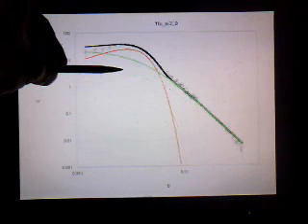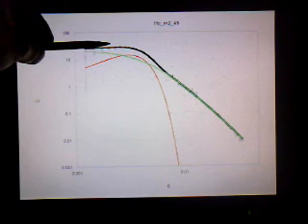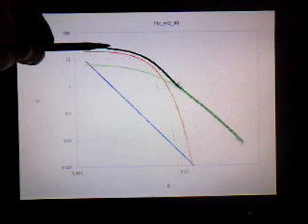field. And now we go to the exchange bias field for this case, and you see there's an order of magnitude increase in the SANS signal. So that's quite exciting.